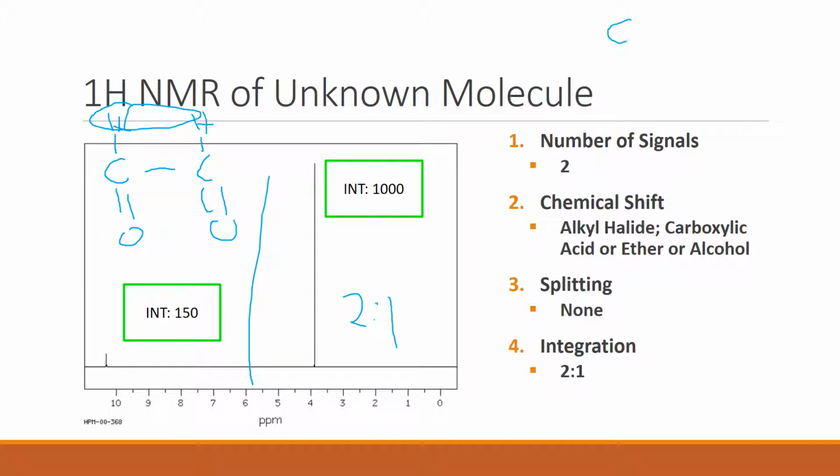Now, if we had, let's say if we go up here, and we had a carbon double bonded to an O, and we had an H, and then we had, let's say, 3 H's. All 3 of these H's would live in the same environment, but this environment would be different than the environment that this guy lives in, okay? Because this guy is closer to this oxygen, which is more electronegative, okay? So we also got to think about what kind of lives these hydrogens are living, that's the way I like to think about it. What's their environment like?